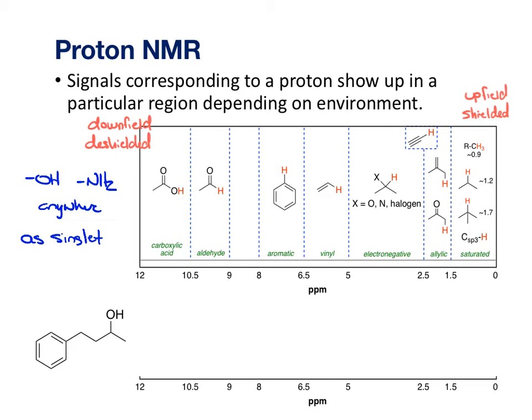So if we want to apply this to our example down here and figure out where these signals go, we need to figure out the different protons involved.